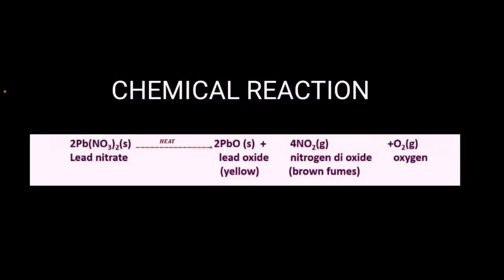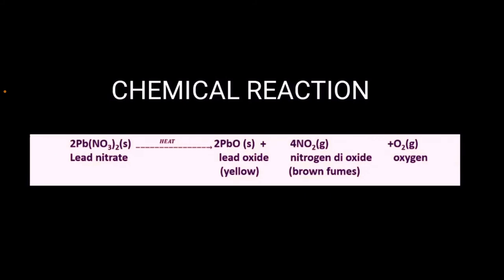What's going on in this cool thermal decomposition reaction is you heat up lead nitrate and it starts to change into that yellow lead oxide, which is a solid, and then it starts to give off that brown nitrogen dioxide gas and oxygen that we tested with our splint.